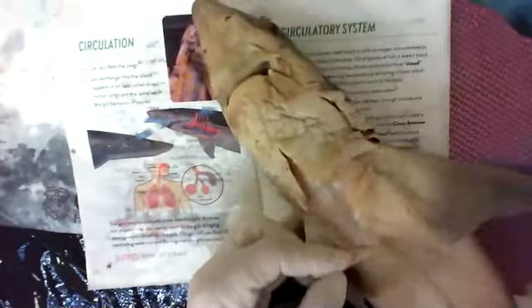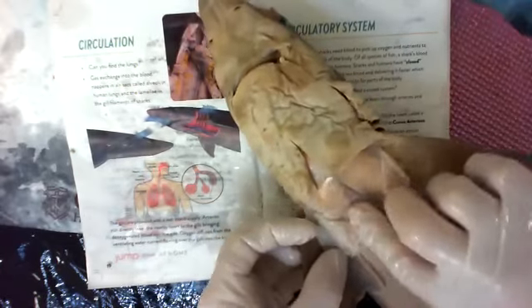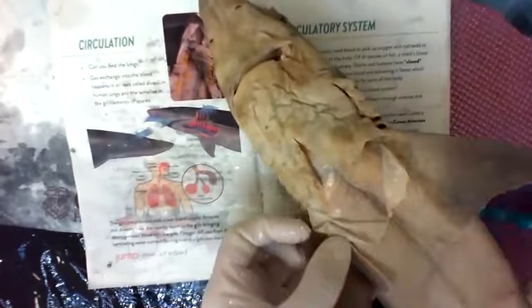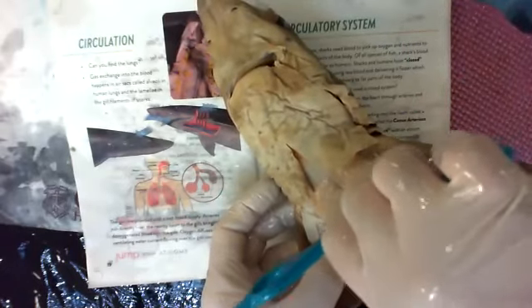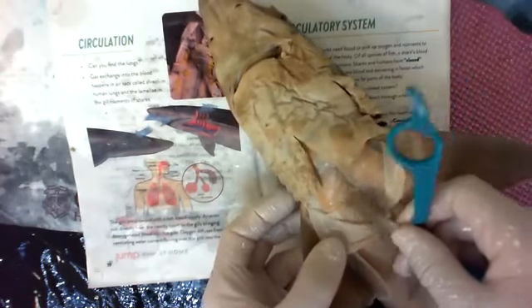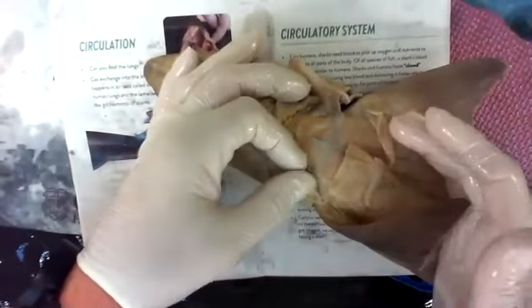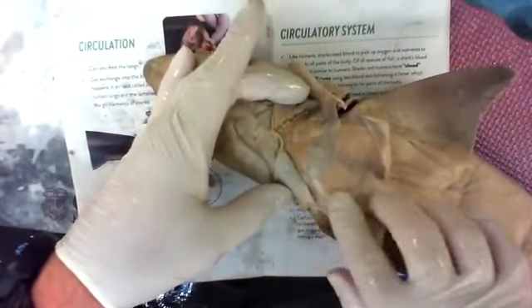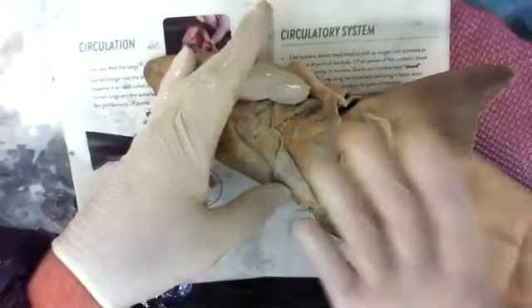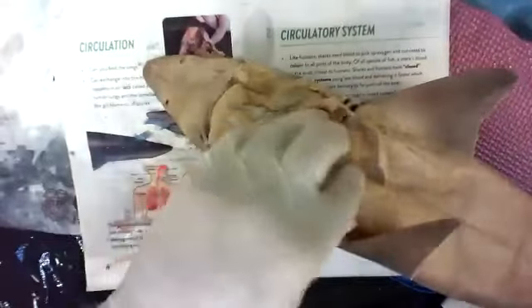And if you didn't cut this far down, don't worry about it. I can open this up and I can see the muscles underneath. And I can see the muscle wrapper, the fascia that's protecting it. If I want to go underneath that fascia and look at the muscle itself, I would have to take a knife or something and cut it open like this. So you can see the fascia starting to peel. Now I would go under, and because this has been cooked in chemicals, just like formalin, if you put a raw egg in a bowl of acid, it would actually turn white because it's getting cooked, but not by temperature, by chemicals. That's what's happened to all the structures in the fish: the tissues were cooked by chemical preservatives. All right, so we're across. You can explore that later. You can peel your whole shark apart later if you wanted to.